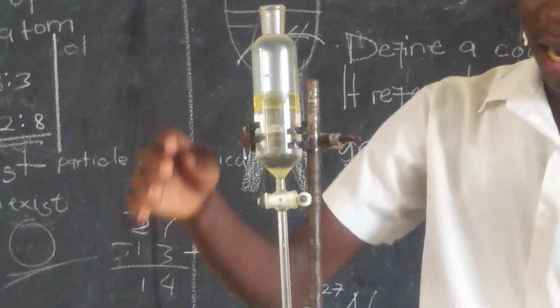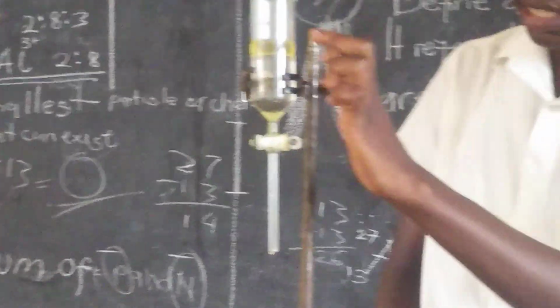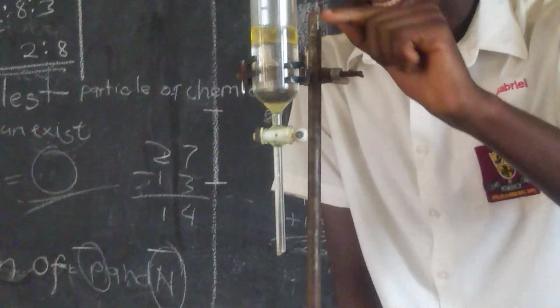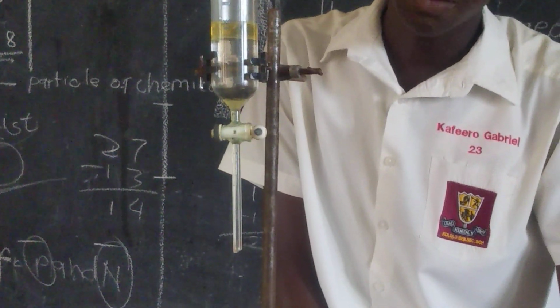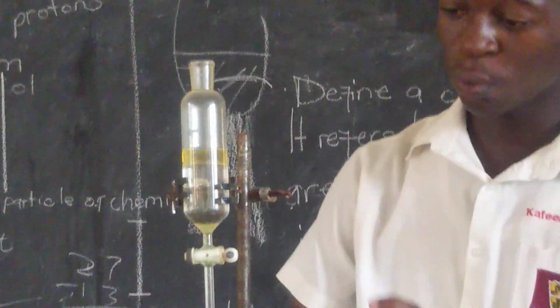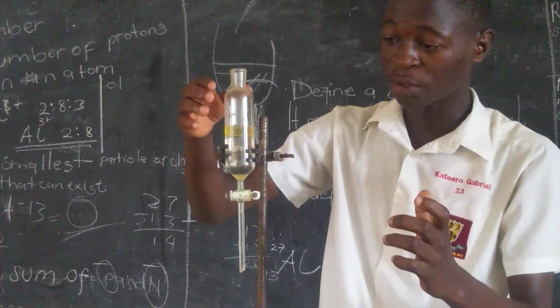I've done it. So I will remove this water first for the cooking oil to remain. Also, don't forget to look at the layers that we talked about. There are two layers that are formed. There's the first layer at the top, which is cooking oil, and there's our second layer which separates water from the cooking oil. So we shall still remove this surface water so that we can get our uniform results.